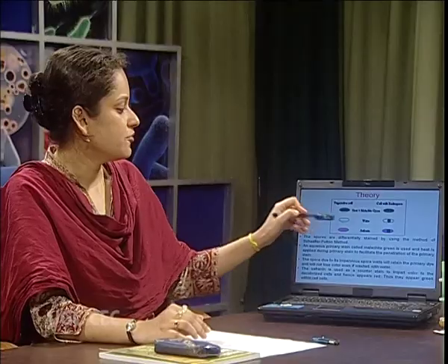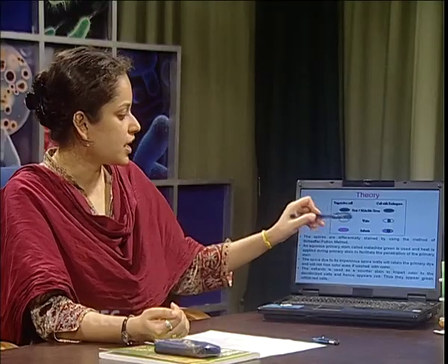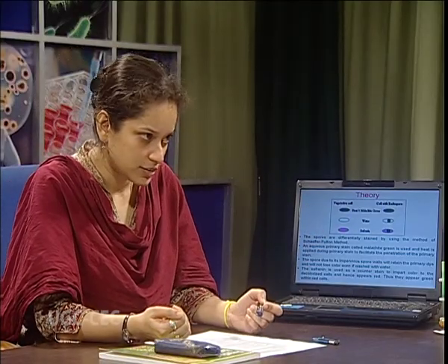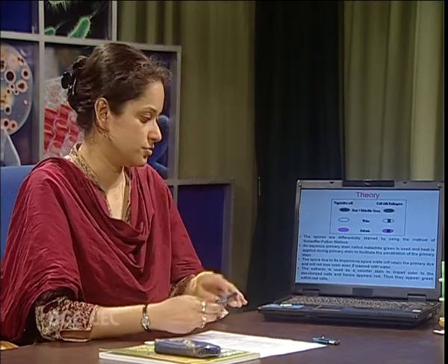So when we use water as a decolorizing agent, what will happen? These spores will only retain the color. Why? Because the stain becomes locked inside the spores. As a result, the stain is not able to come out due to the impervious spore coats. Then we counter stain it with safranin. So under a microscope, it will appear green within red cells under the oil immersion lens of the compound microscope.